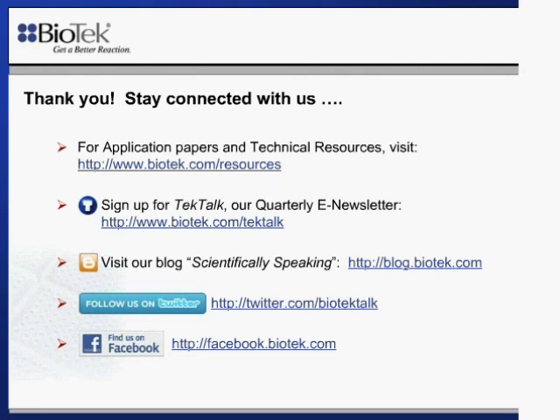And one last one. Please confirm Take3 works in fluorescent assays in addition to absorbance assays. Yes, some of the early Take3 plates that went out did have white slides. So if you already have a Take3 plate, just check to see that it has a black coating on the slides where the microspots are not.